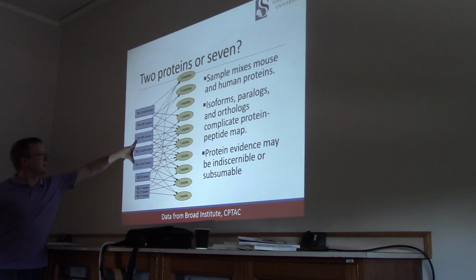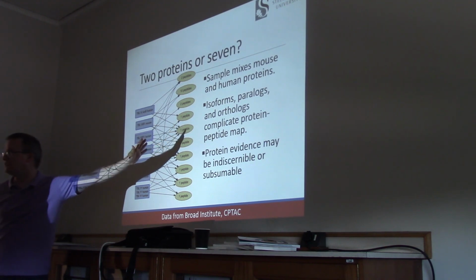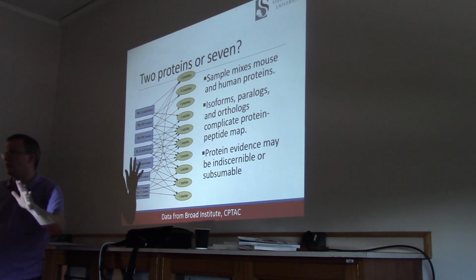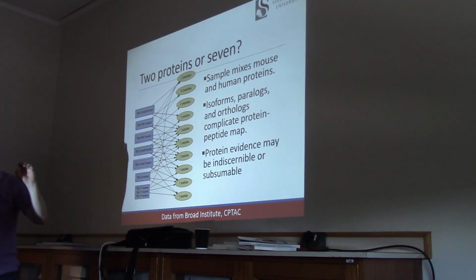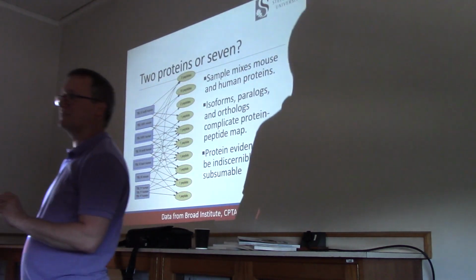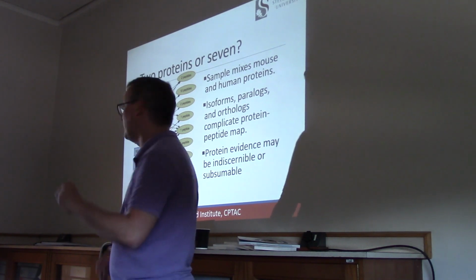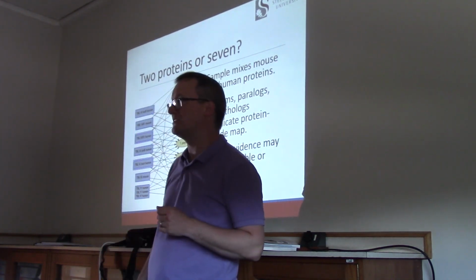If you were to accept that these two proteins are present, all of those peptides at the right have been accounted for. So, parsimoniously, in proteomics, we would say these two proteins are sufficient to account for all of the evidence at the right. None of these others can be claimed as identifications. They are artifacts of the appearance of these two proteins having been present.